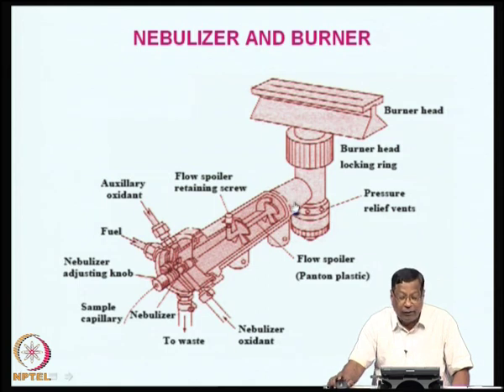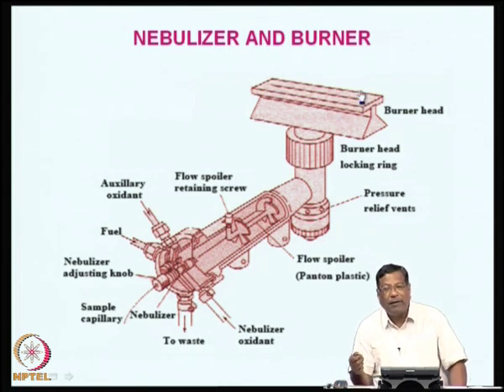You can see that whatever is sucked along with the gases is fed into this burner, where it opens up in a flat steel plate or a titanium plate with a slotted burner head. That means, there is a small opening of about 0.5 mm on the top of the burner, which you can light just like you light any gas equipment in your house.